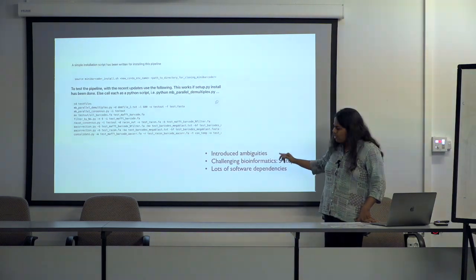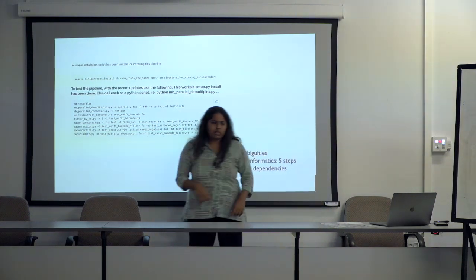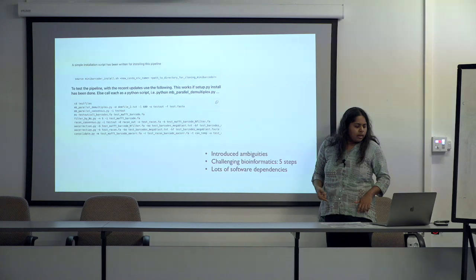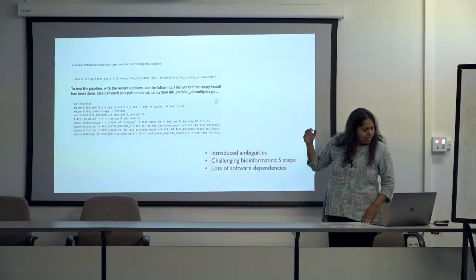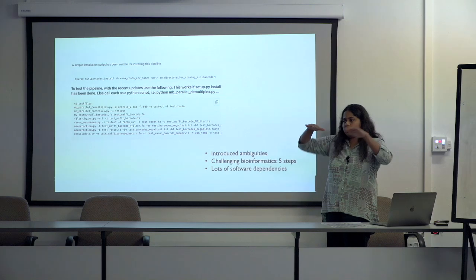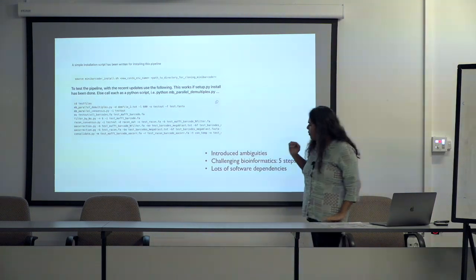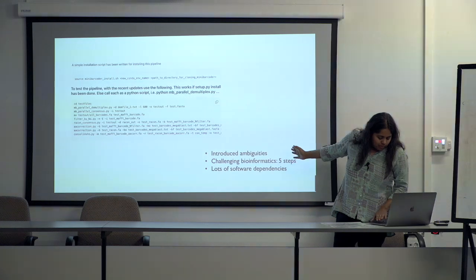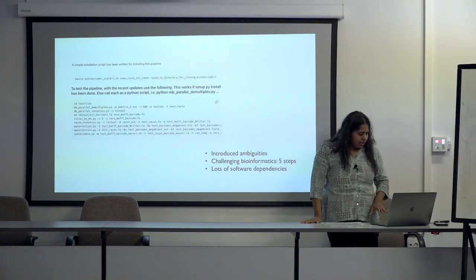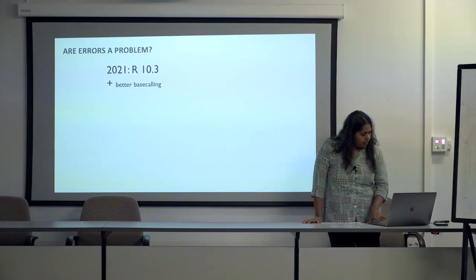And because we had a lot of software dependencies, one of the ones that we used was Racon, which was a polisher for nanopore data. Basically we used multiple consensus rounds to correct and eventually got to a decent answer. But we wanted this pipeline to be usable for everybody, and in 2018 this was not really doable.